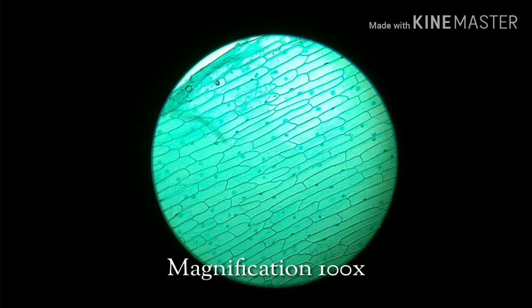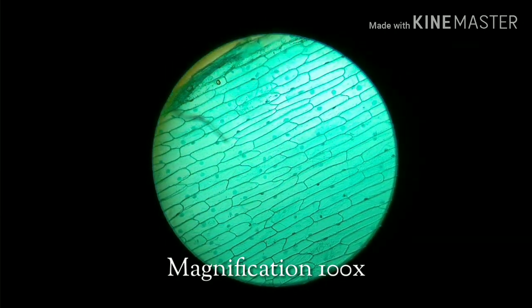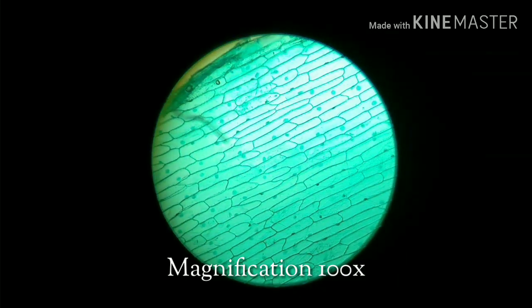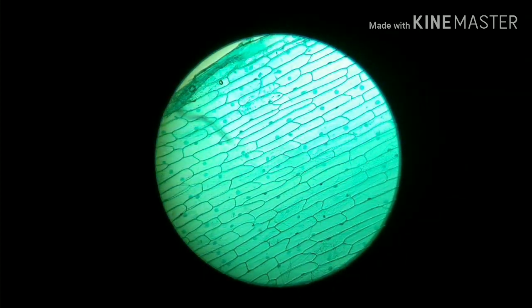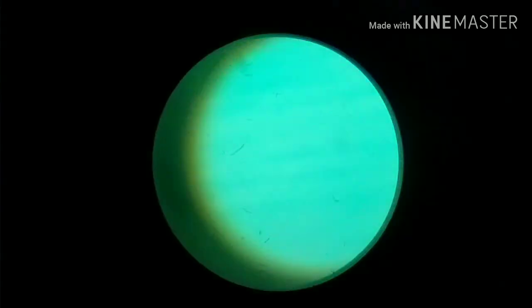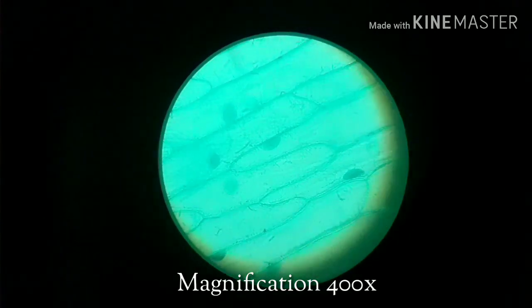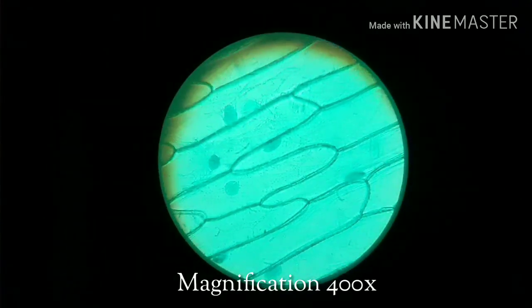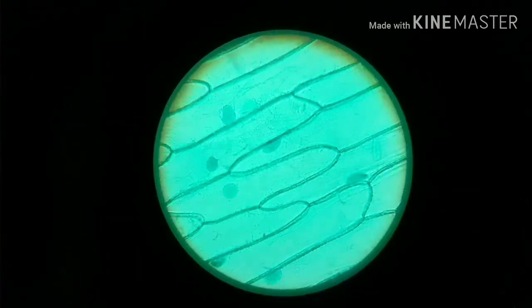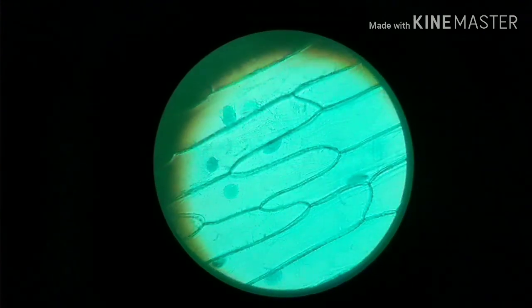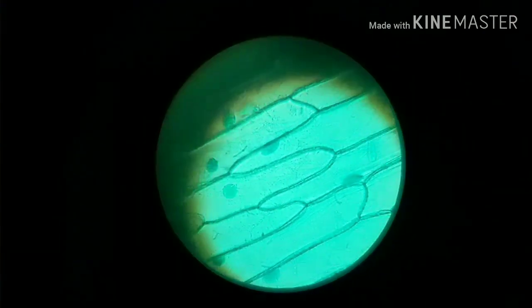This is a result of onion cell for magnification 100. Next, this is a magnification 400 for allium cepa.